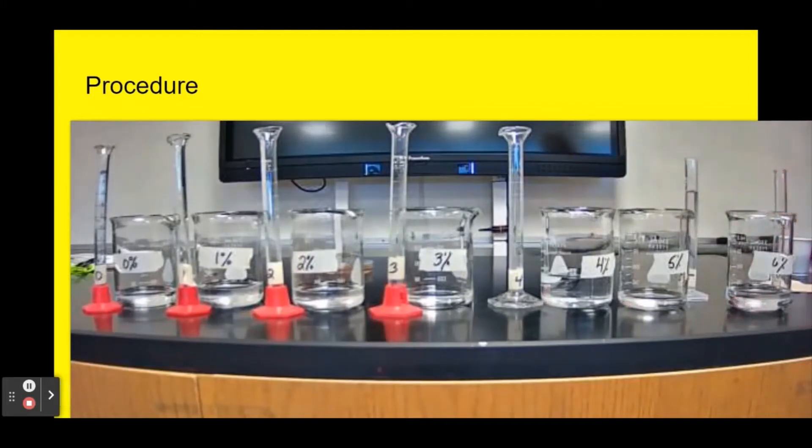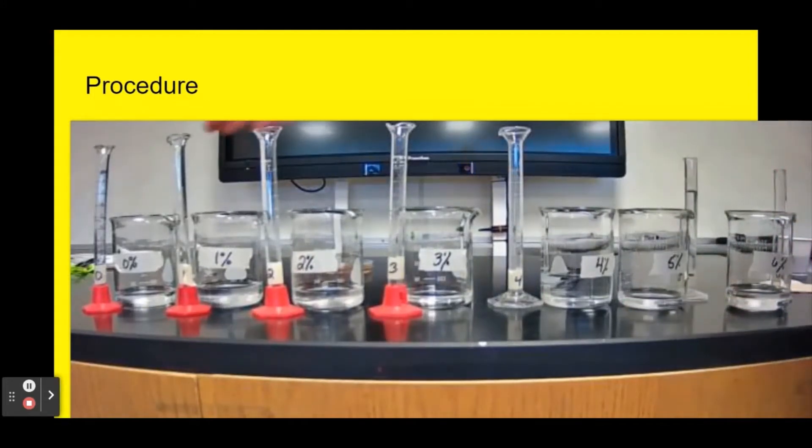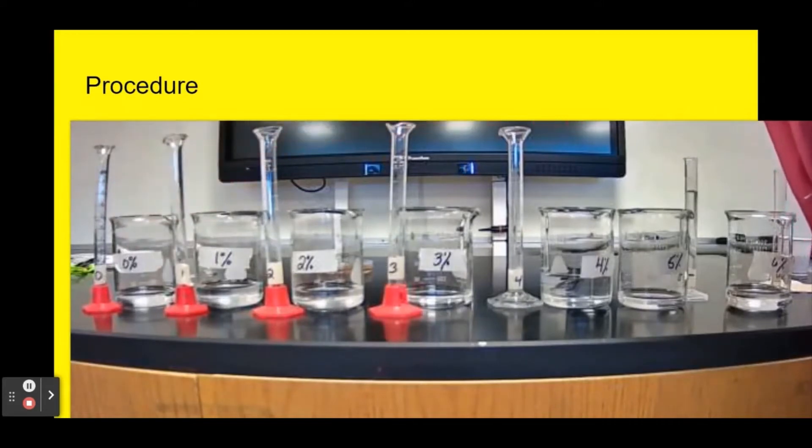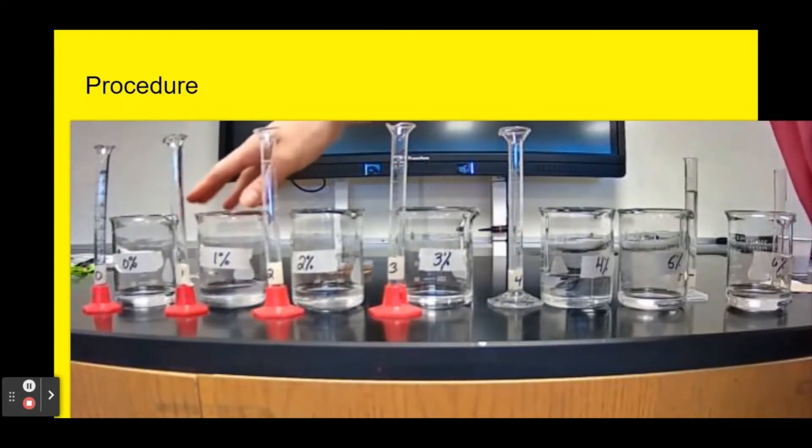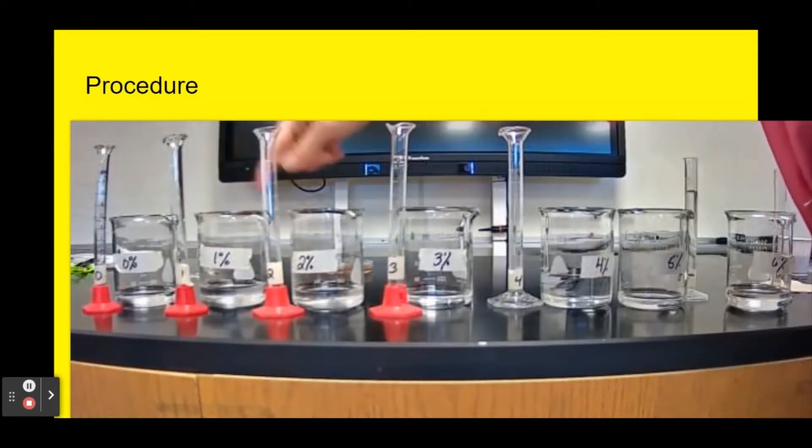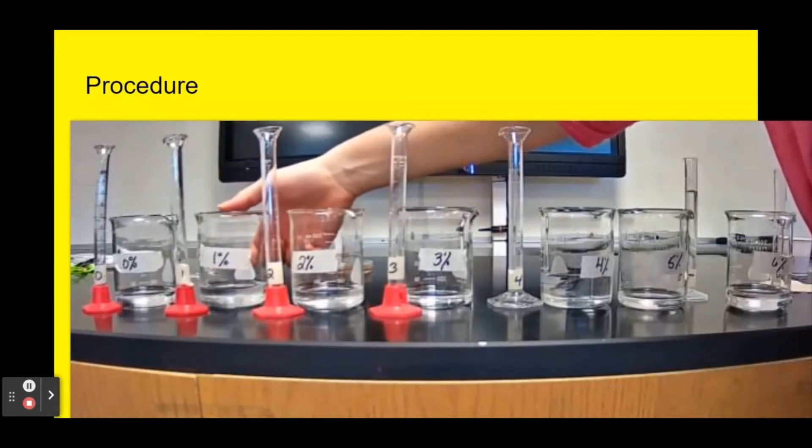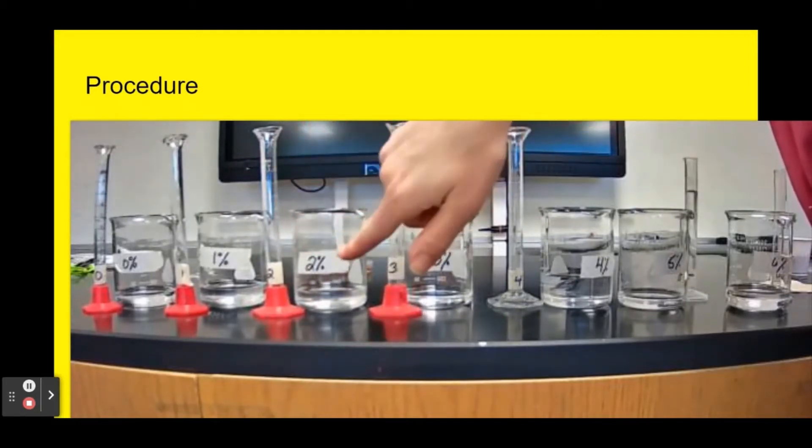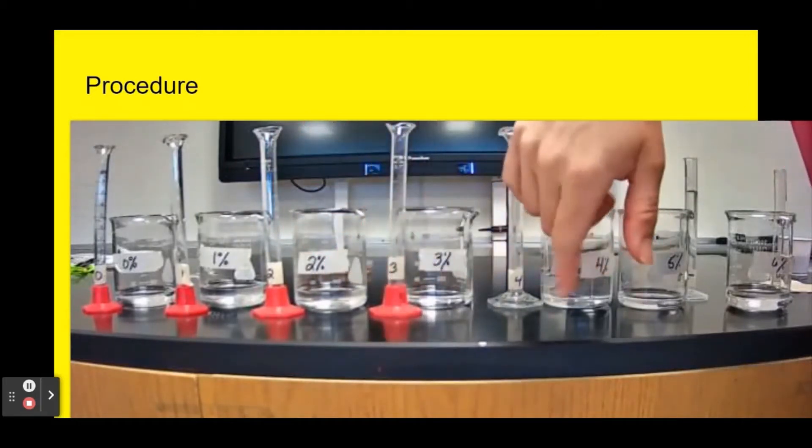I have now my setup where I've got all my different percentages of acid. This one is 0% acid, 100% water. This one would be made with 99 milliliters of water and 1 milliliter of acid, 98 milliliters of water, 2 milliliters of acid. You get the idea.